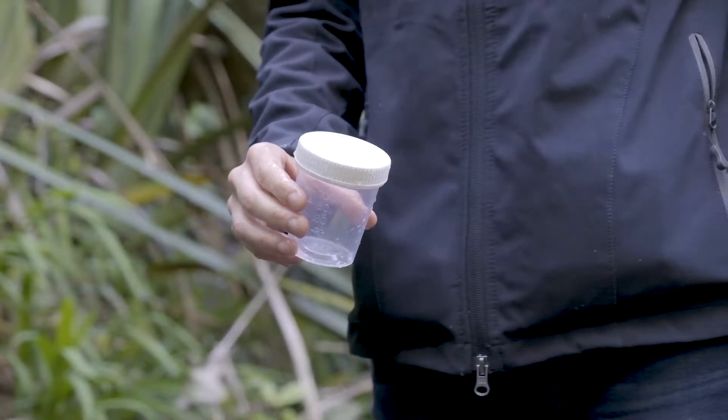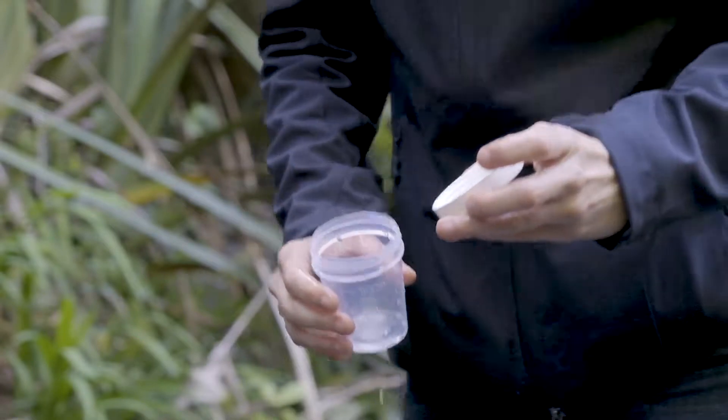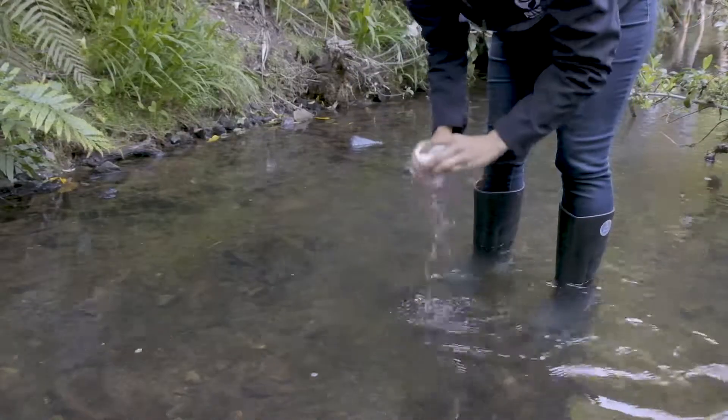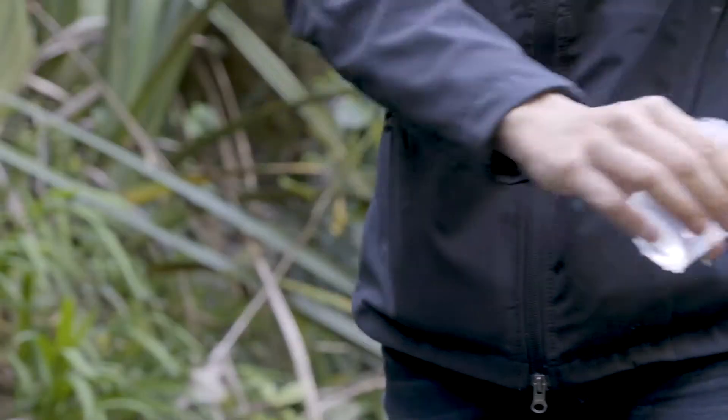Remove the lid from the bottle just before sampling. Don't touch the inside of the bottle or the lid. If you do, make sure to triple rinse the bottle with stream water.